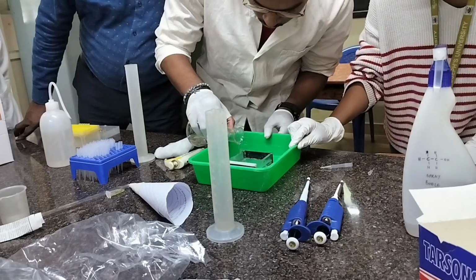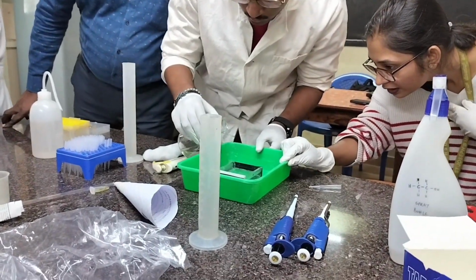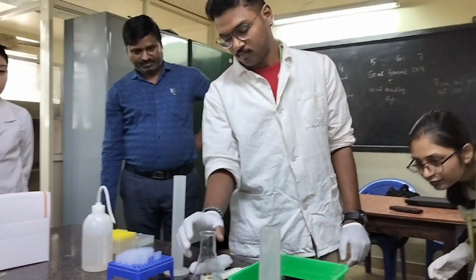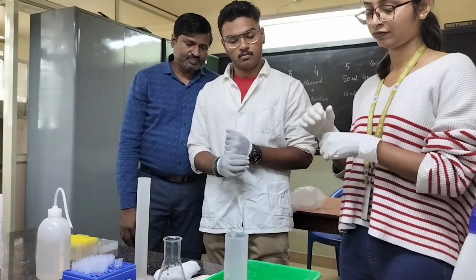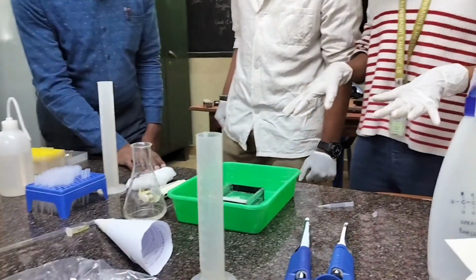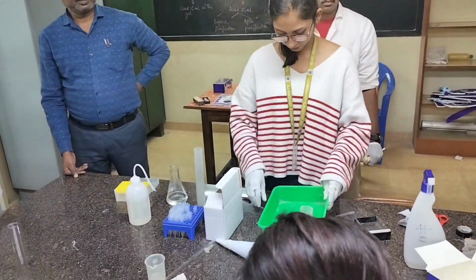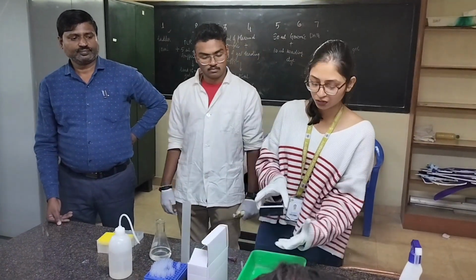Pour the agarose solution into the central part of the tank when the temperature reaches approximately 60 degrees. Do not generate air bubbles. The thickness of the gel should be around 0.5 to 0.9 centimeter. Keep the gel undisturbed at room temperature for agarose to solidify. The next step, that is electrophoresis. Pour 1x TAE buffer into the gel tank till the buffer level stands at 0.5 to 0.8 centimeter above the gel surface. Gently lift the comb, ensuring that wells remain intact.